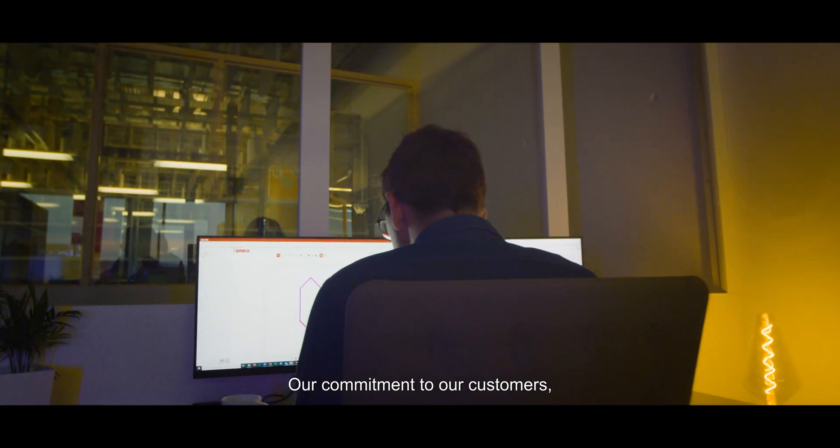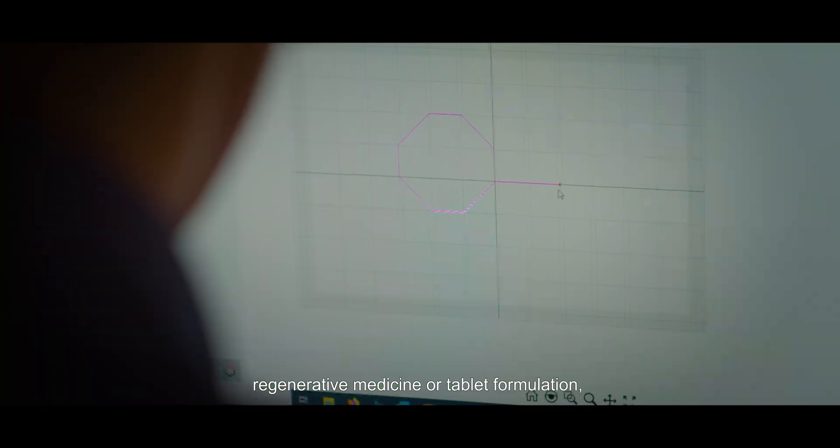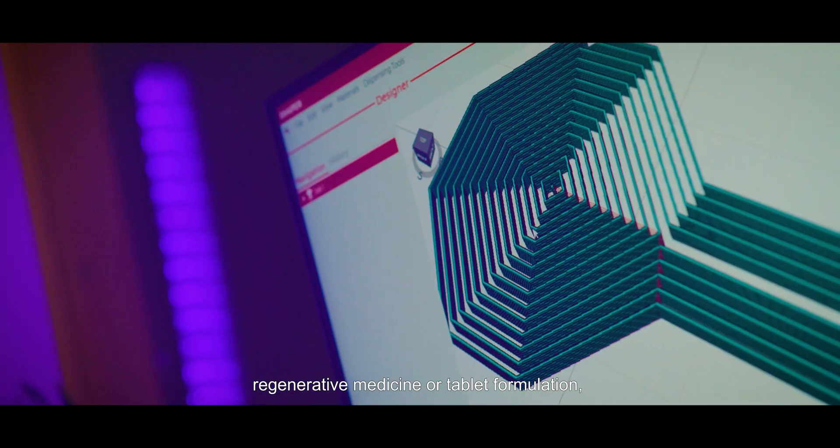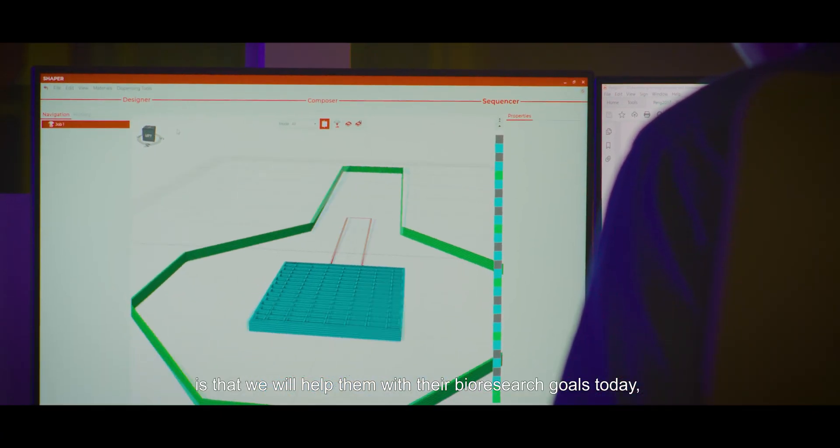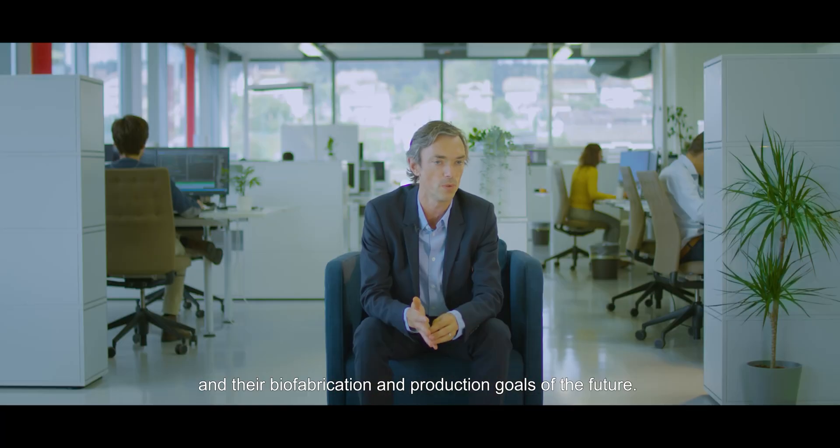Our commitment to our customers, whether they're interested in tissue engineering, regenerative medicine, or tablet formulation, is that we will help them with their bioresearch goals today and their biofabrication and production goals of the future.